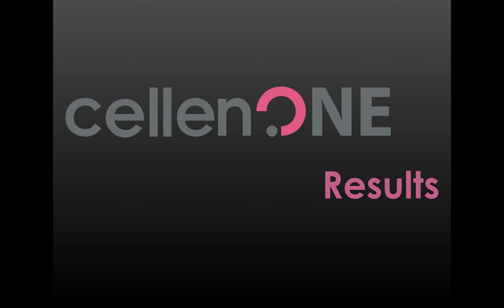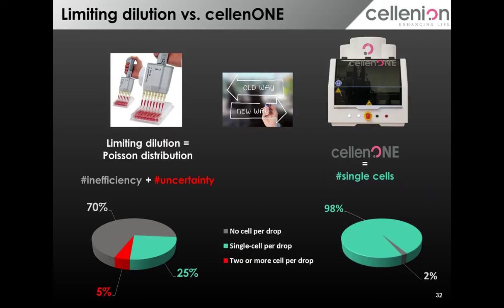Thank you, Guilhem. So we have seen the background of the technology and how the gentle dispensing is able to maintain and isolate single cells. And now I would like to go into details of some of the results that we have compiled over the months from the machine, from the CellenONE.